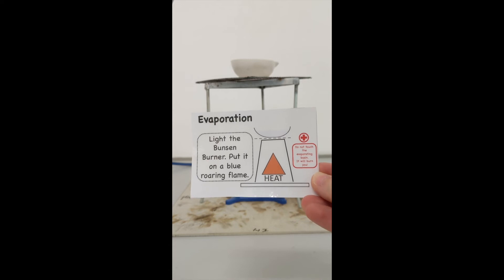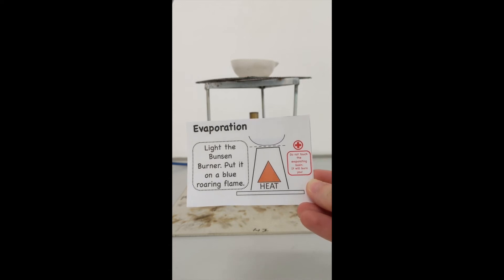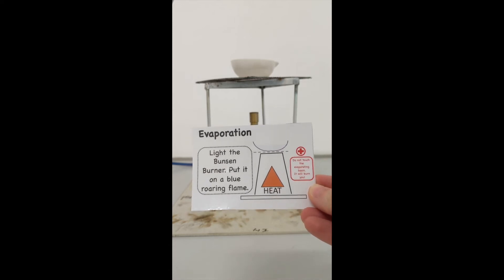Now I'm going to light the Bunsen burner and then turn it onto a blue roaring flame by opening the air hole.